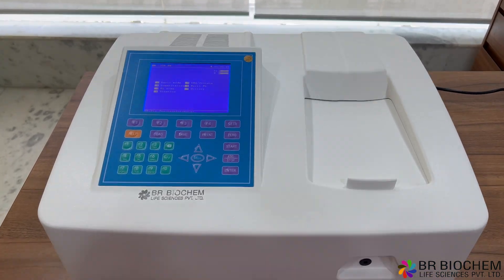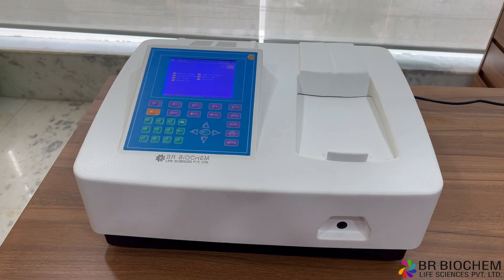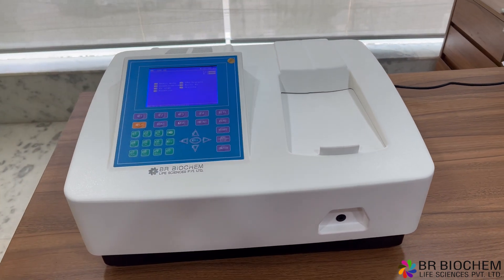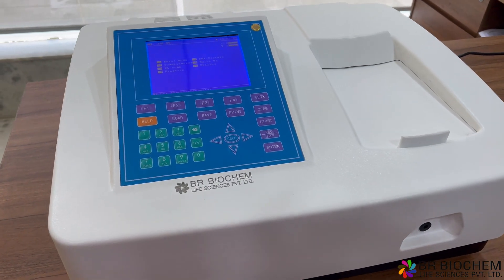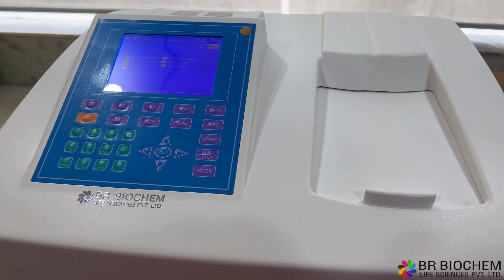Introducing the Double Beam UV-Vis Spectrophotometer, an advanced instrument designed to meet your analytical needs. Equipped with a double beam optical system, this spectrophotometer effectively minimizes drift and compensates for blank changes, making it ideal for long-term testing. Let's explore its impressive technical specifications and the convenient features it offers.